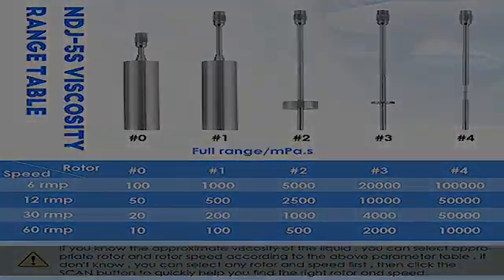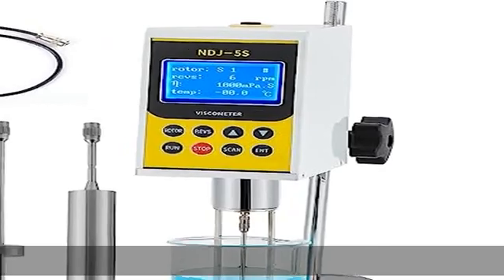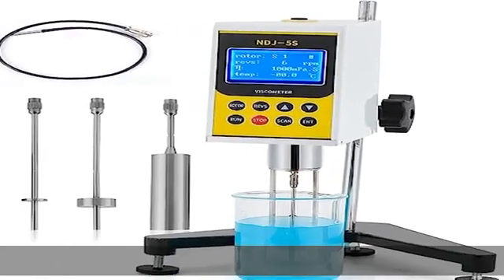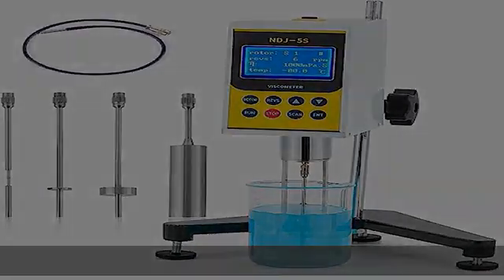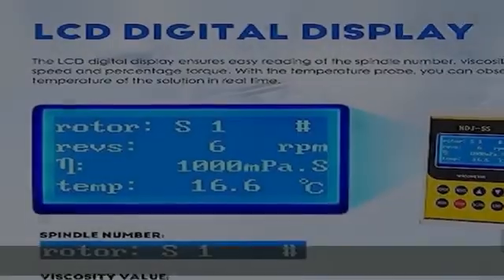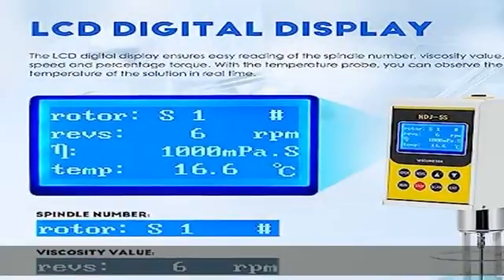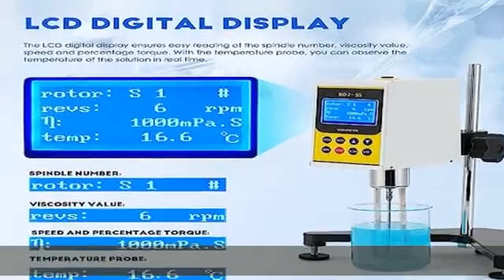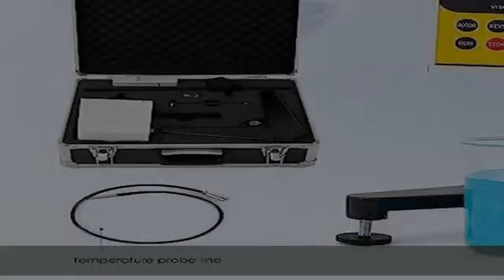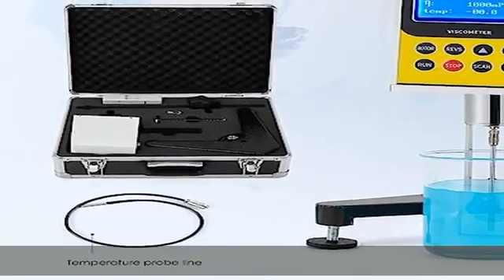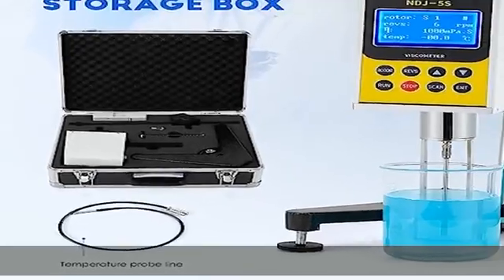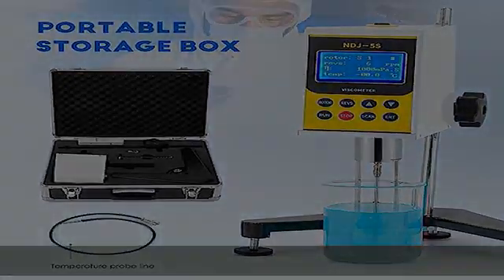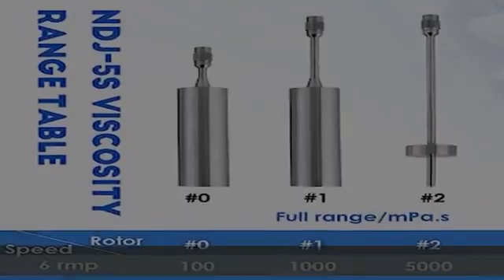The LCD digital display has perfect data acquisition and can display the number of rotors, speed, viscosity, and percentage at the same time. The LCD display uses high-brightness blue backlight to display results more clearly. Reliable and easy to use.